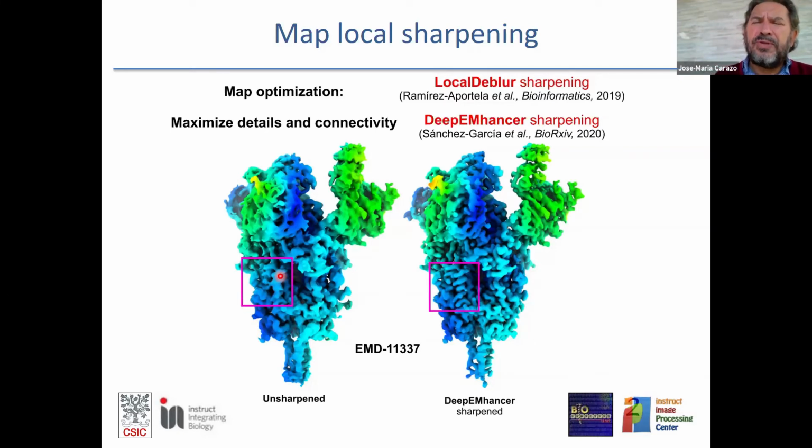This was using mathematical and statistical principles that were able to measure that difference, and was able to tell us, well, in this part of the map, simply you do not have, no matter what sharpening or over-sharpening or whatever you have done, simply you do not have resolution. And we do that without the sharpening approach.